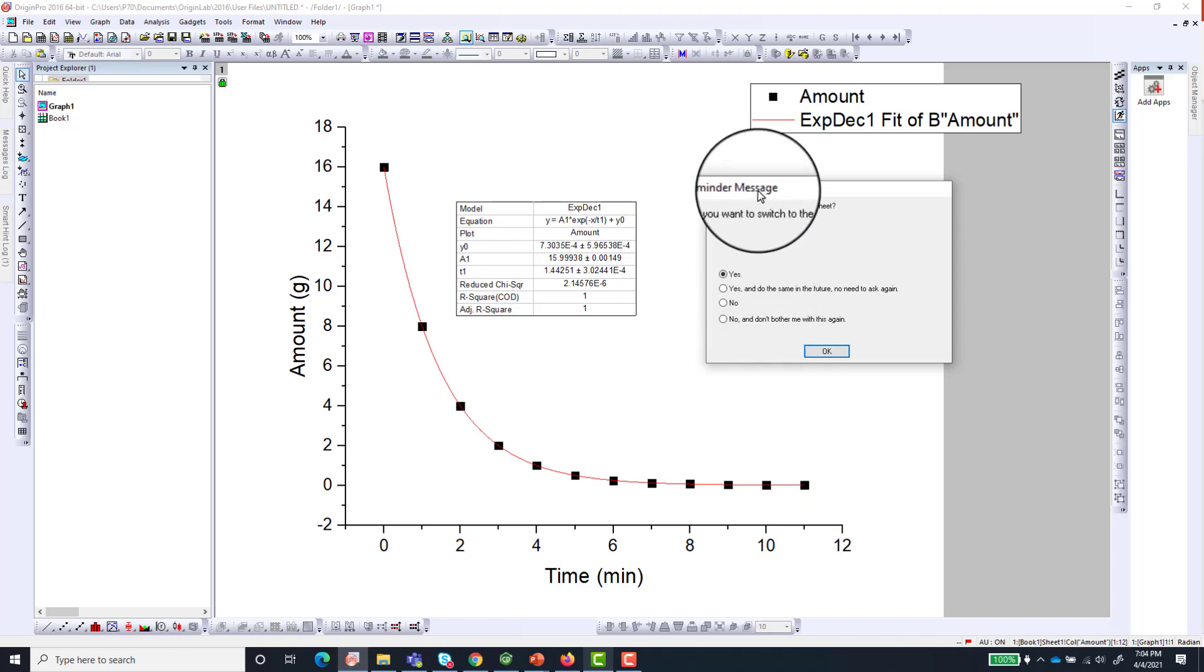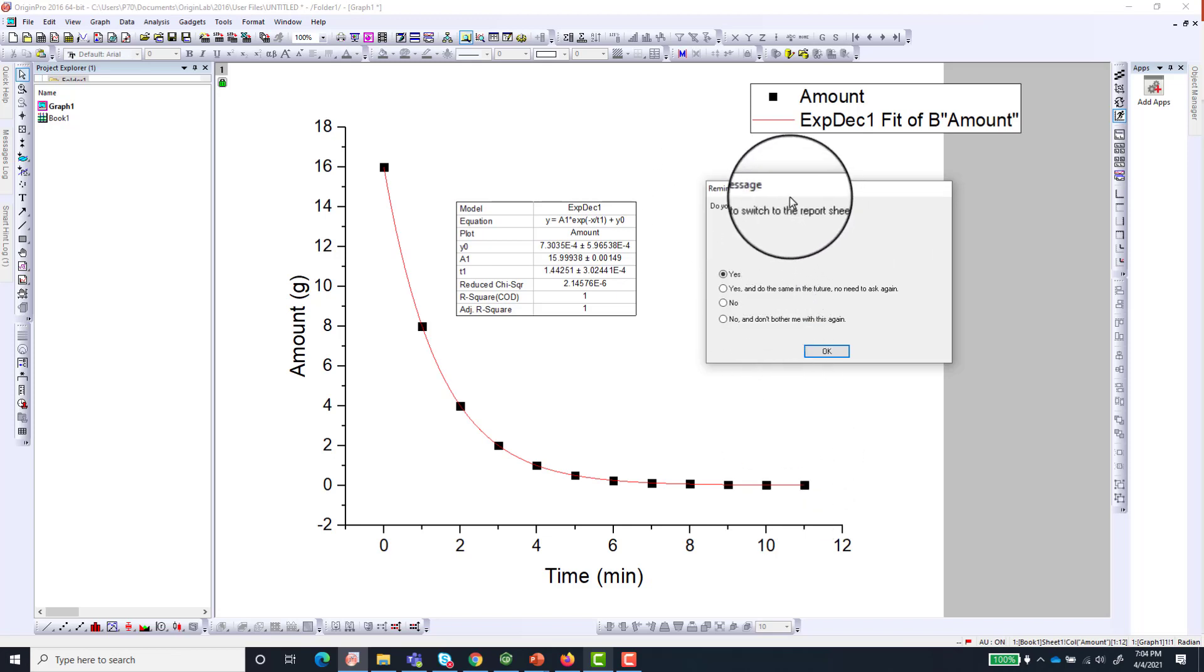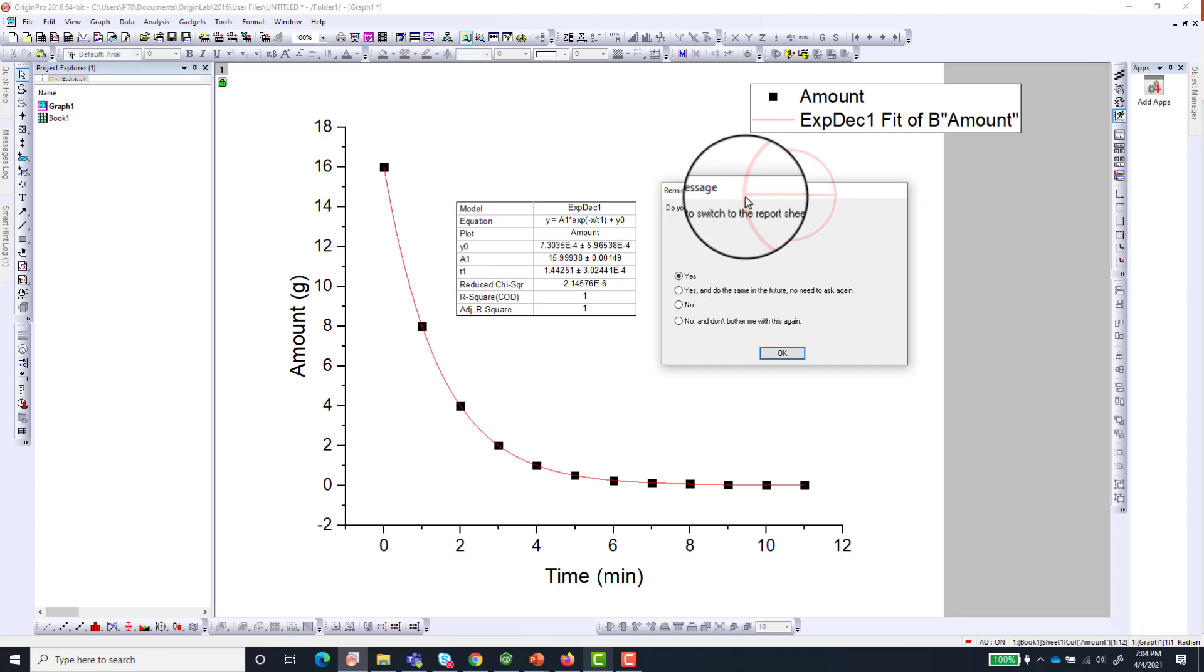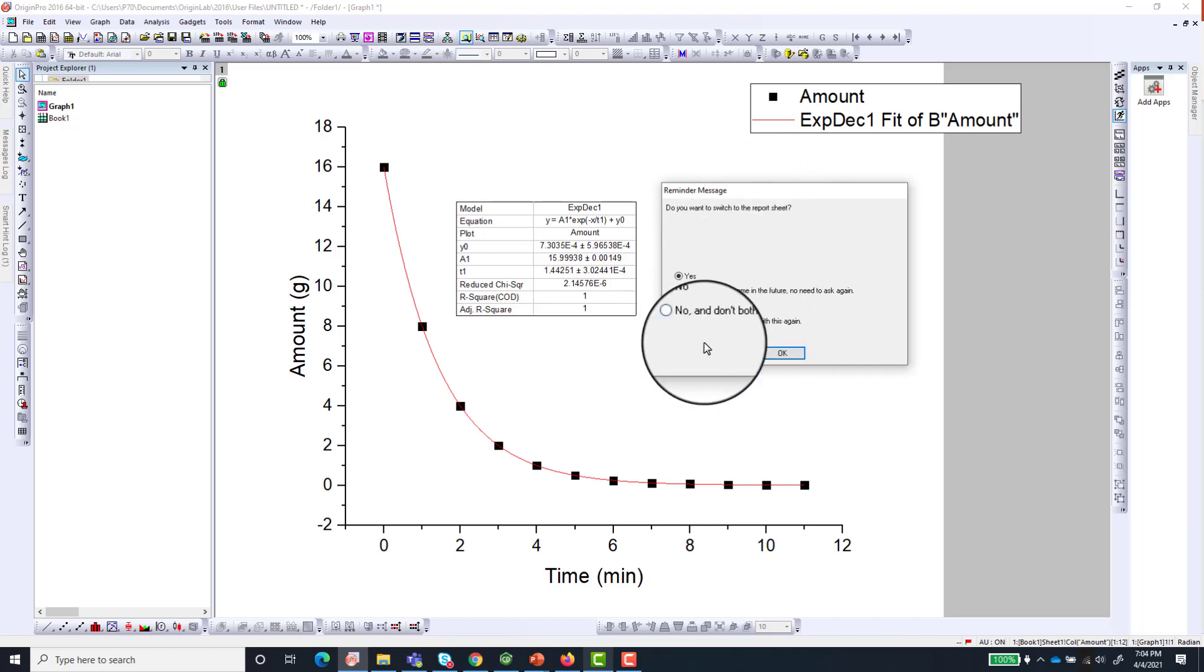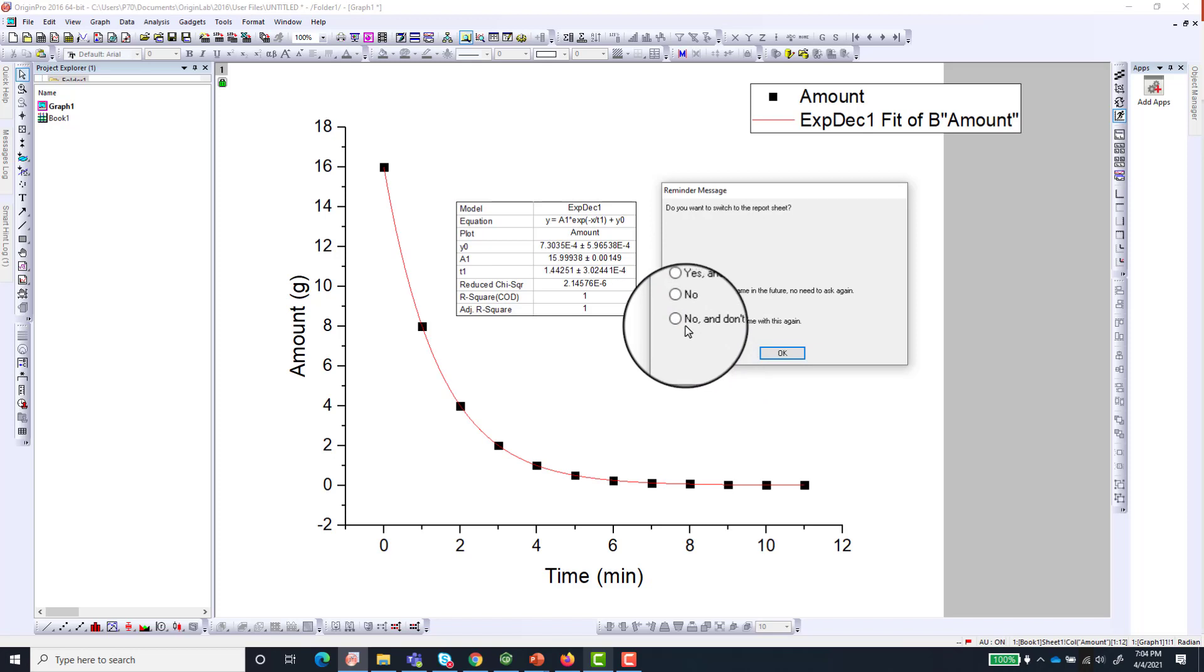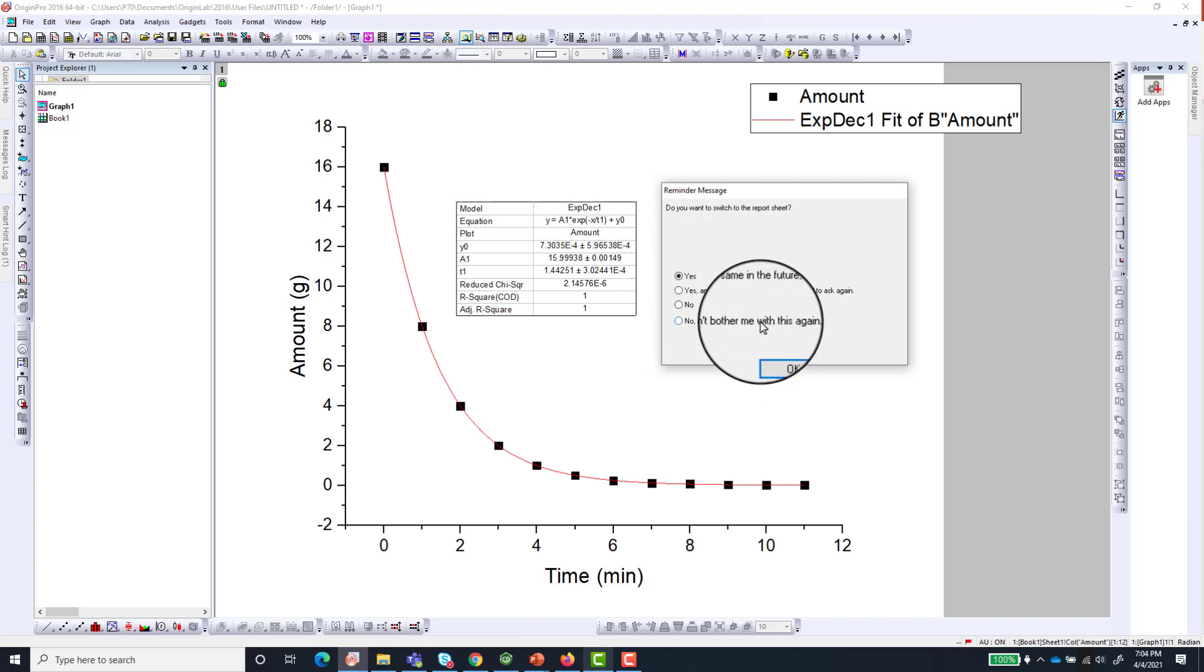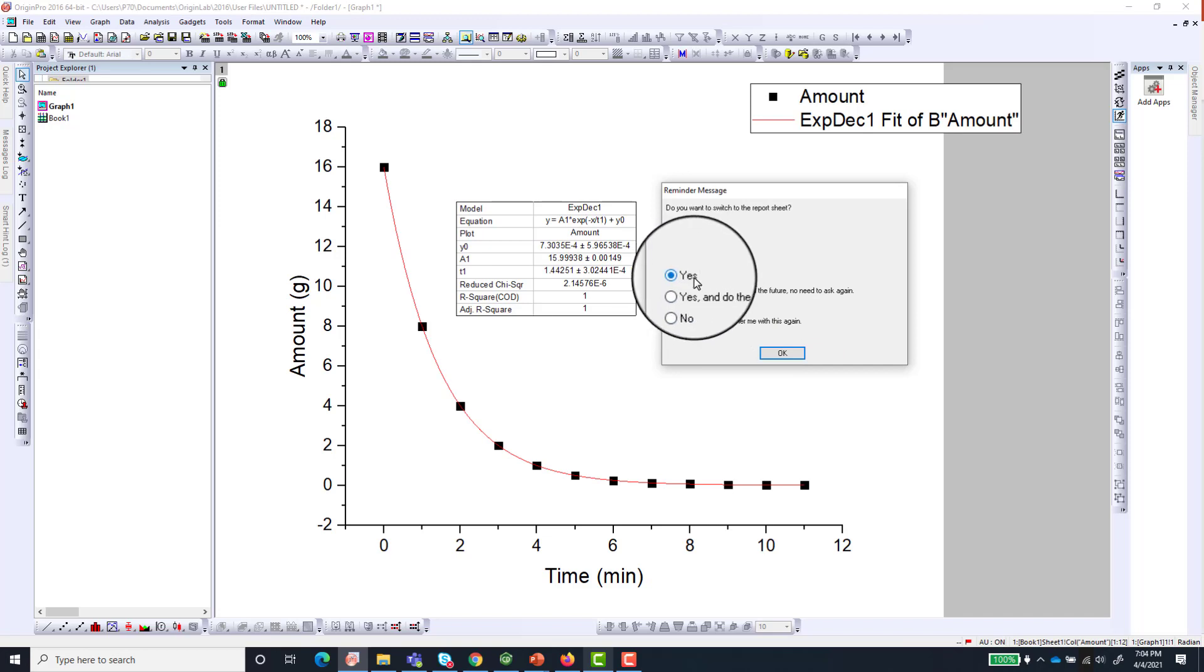This is a window that usually pops up whenever you perform a fit, and most of the time for the first time this happens. But you can choose not to be bothered by this again. What it's asking you is do you want to switch to the report sheet of your fit.